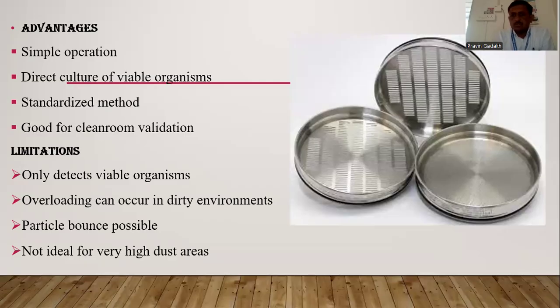So that is all about the sieve type of method of the solid impingement device.